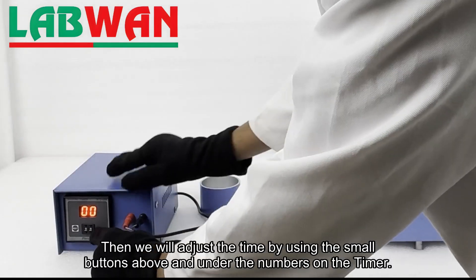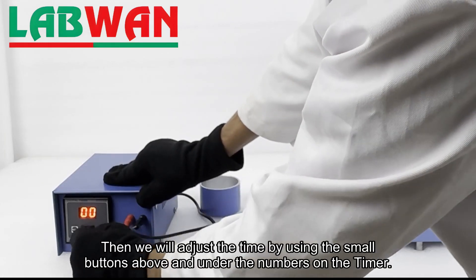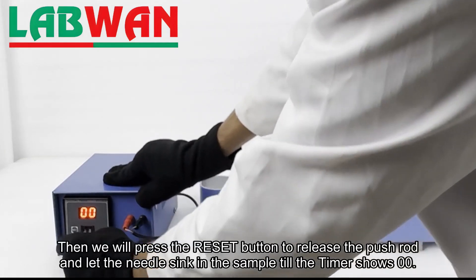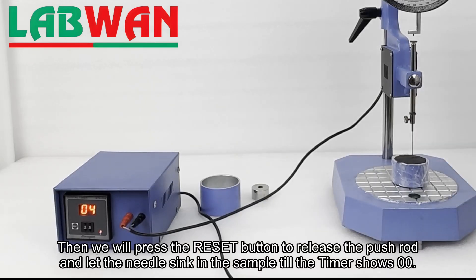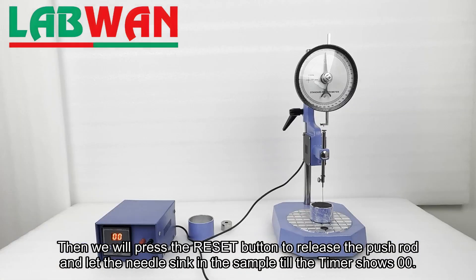We will adjust the time by using the small buttons above and under the numbers on the timer. Then we will press the reset button to release the push rod and let the needle sink in the sample until the timer shows double zero.